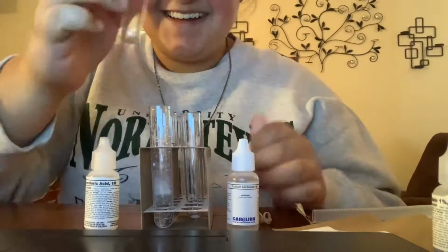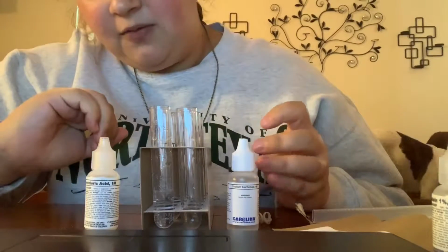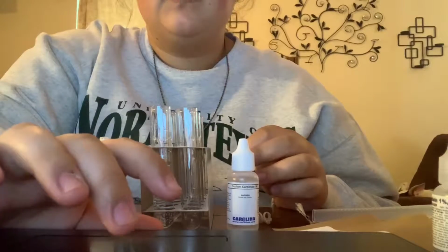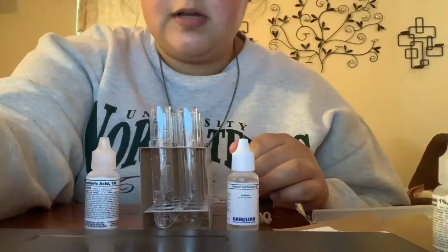Whoa! Cool. So I can see that there's a gas being released and lots of bubbles. So I will finish the rest of the experiment and come back and record myself doing the next part.